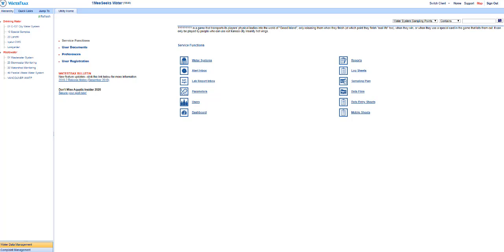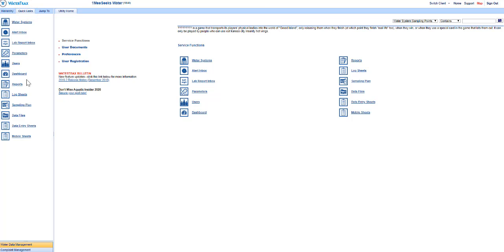Today I'm going to talk about the new 2020 features for our dashboard update. If you've never used it before, speak to your administrator to configure it, or if you are the administrator, head over to the dashboard icon on the main page or to the quick links on the left side and open up the dashboard icon there. We packed quite a few features for a few of the widgets within the dashboard, so let's get started.